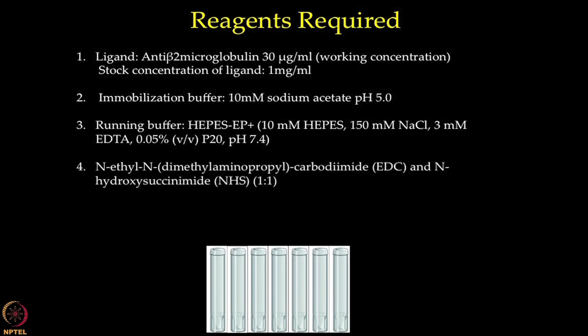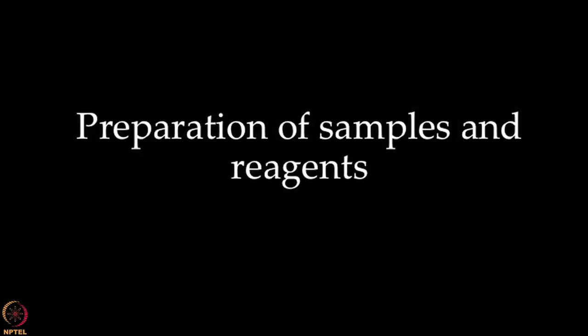EDC and NHS in the amine coupling kit are used in 1:1 ratio for surface activation. Lastly, we also require 1 molar ethanolamine HCl pH 8.5 for blocking the free ester groups on the surface. We shall now proceed to use the above mentioned reagents for our immobilization experiment. We will now work on the reagents required for the immobilization of anti-beta-2 microglobulin on the sensor chip surface.